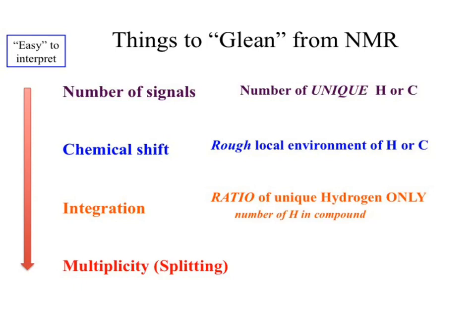And then the last thing, actually before we even do the last thing, our integration will only apply to hydrogens. Okay? We'll avoid looking at carbons. Any ideas why we'll avoid looking at carbons? Carbon signals, percentage-wise, are much, much lower than hydrogen. When we're looking at our hydrogen NMR, we're looking at hydrogen.